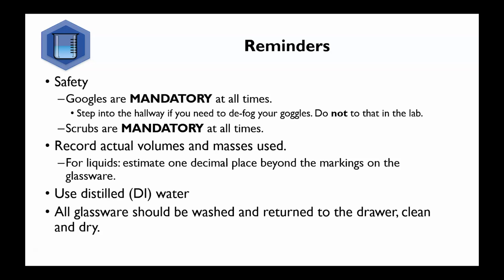Third, use distilled water to avoid introducing additional impurities into your reaction. Please make sure you follow your TA's direction on using the DI water tap and that you carefully push the handle downward when attempting to get the water on. The DI water tap is regulated, so please don't force the handle while trying to increase the rate of the water flowing out. And finally, don't forget that you need to return your glassware clean and dry to your lab drawer.